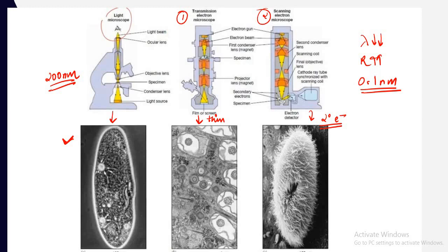The main difference is that electron microscopes cannot visualize any live processes because the sample is dead. There are two reasons. First, the samples are placed in a vacuum; the whole system works under vacuum. And second, sample preparation requires heavy metal staining and harsh chemicals, which kill the live cells.